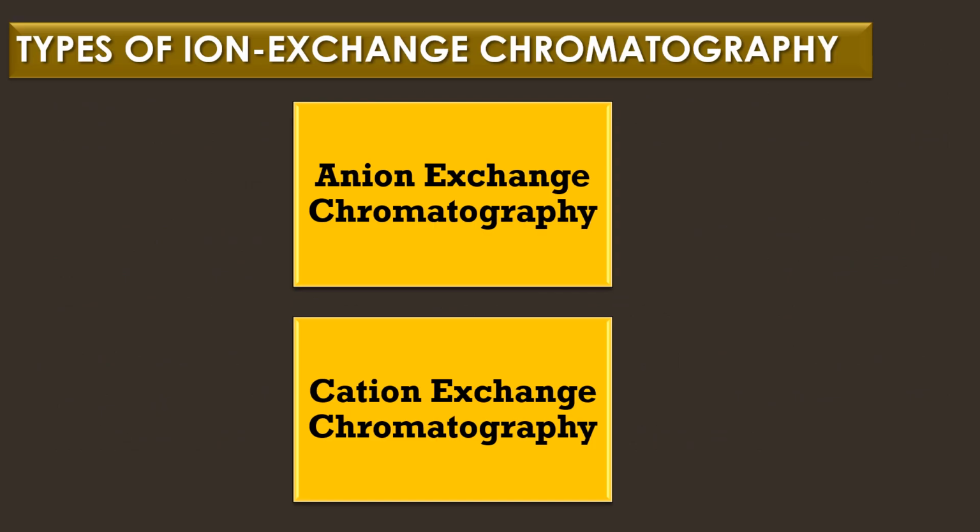Types of ion exchange chromatography. There are two types of ion exchange chromatography. They are anion exchange chromatography and cation exchange chromatography.